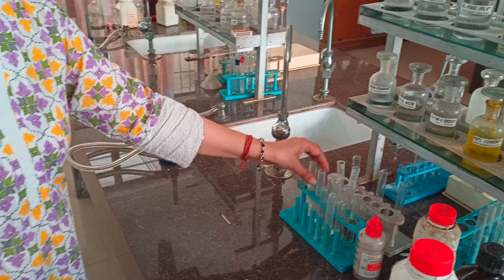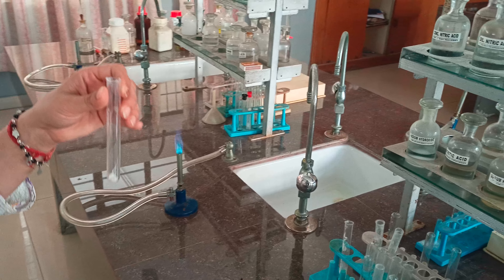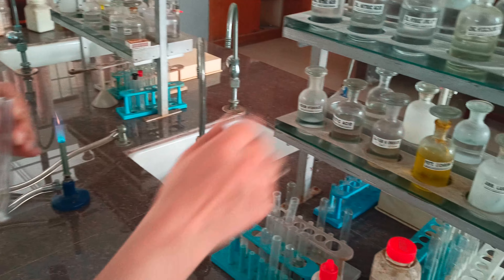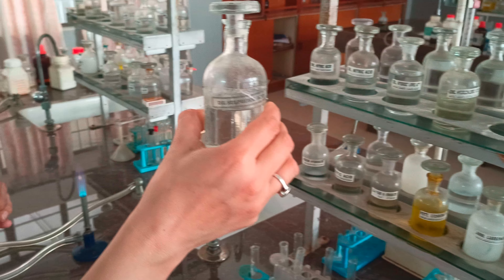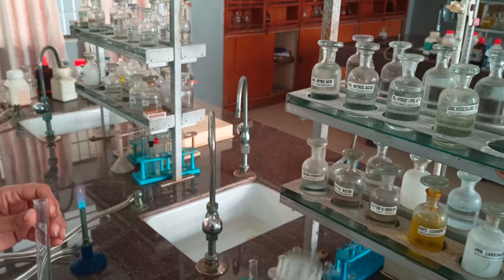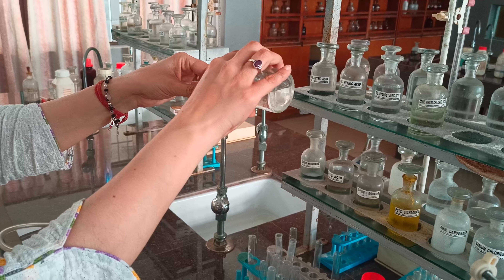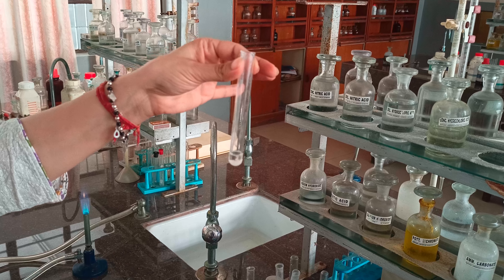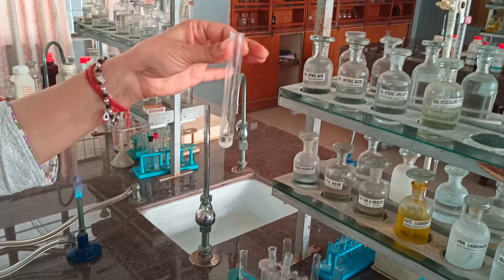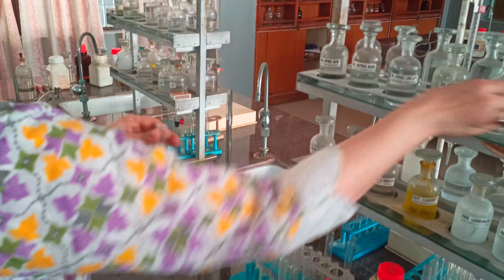After the preliminary test, we have to identify the acid radical. For this, the first step is to add dilute sulfuric acid in the test tube. You can see nothing happened, which means carbonate, sulfide — all of these are absent.